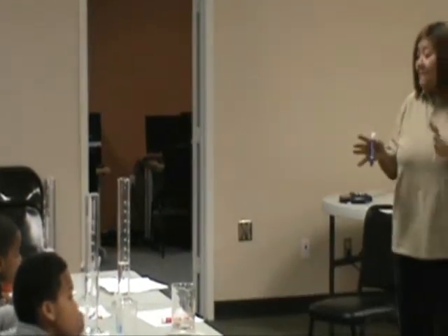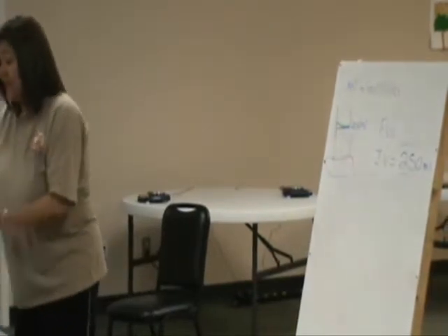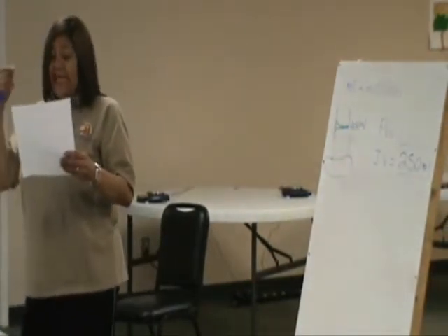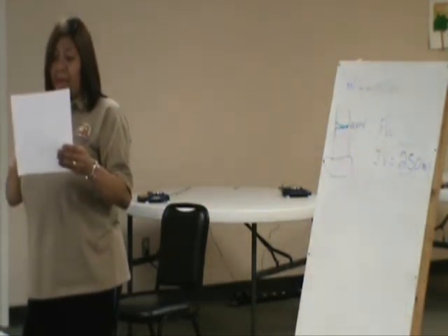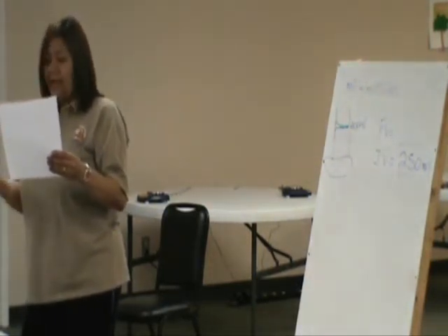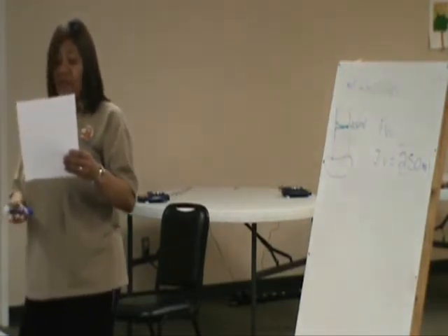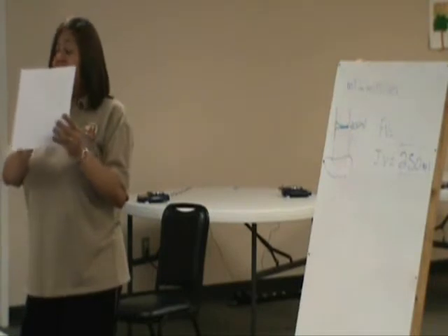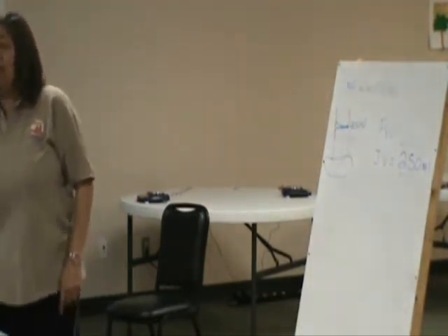Okay, so at this time, I want all of you to get ready for the next measuring device. Our next measuring device is the balance. Now, it says here, and I'm going to back up to number 1, zero the balance using the adjustment knob. Read at eye level. Weigh the object and record its mass. On item 1, you will record the mass of your unknown metal.